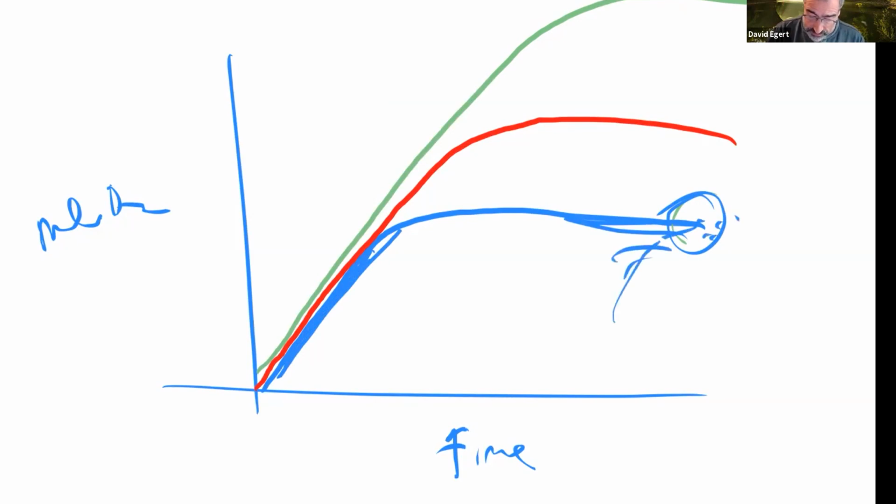At this point, this is how much oxygen I've made when the reaction's done. In the red case, we can see it's going at the same slope, which means the rate isn't any faster. The rate is the same. It goes longer. By the time you're done, you've made more oxygen because you had more substrate to start. But the rate is the same.